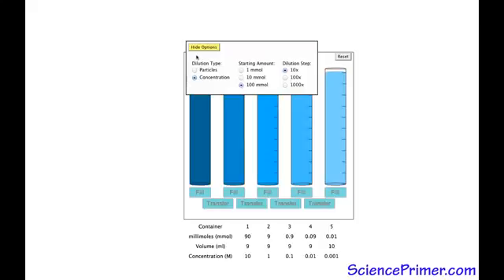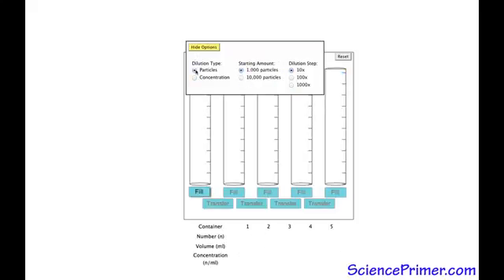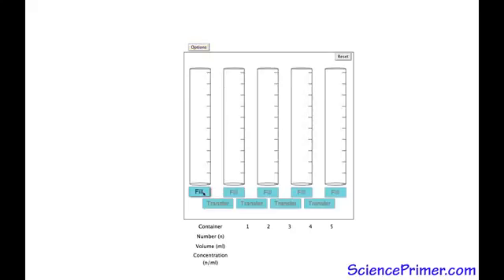Dilution series give very uniform results when working with well-mixed chemical solutions at molar concentrations. Results are more variable when the starting solution is a well-mixed suspension of particles as opposed to a mixture of dissolved molecules. The reason for this is that a well-mixed solution of molecules at concentrations in the molar or millimolar range have billions upon billions of molecules in each milliliter, while a suspension of particles often have relatively dilute concentrations of only thousands of particles in the entire volume.